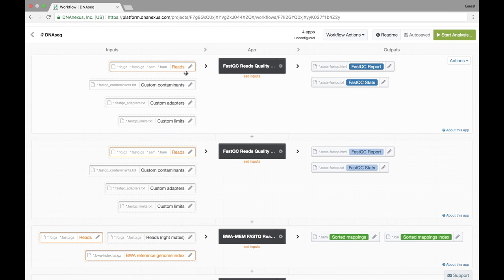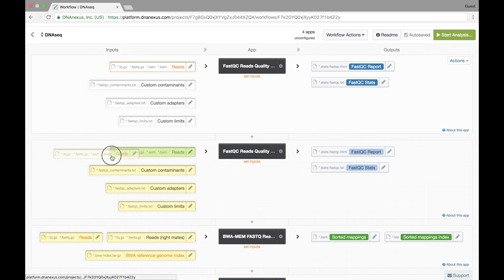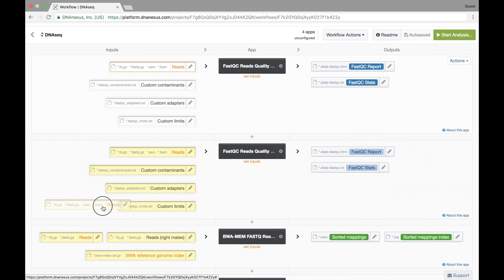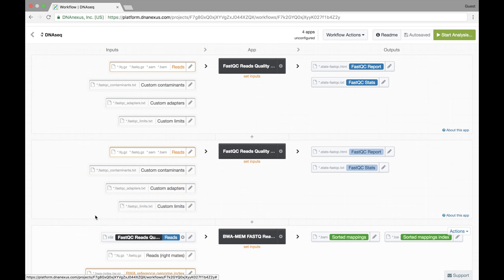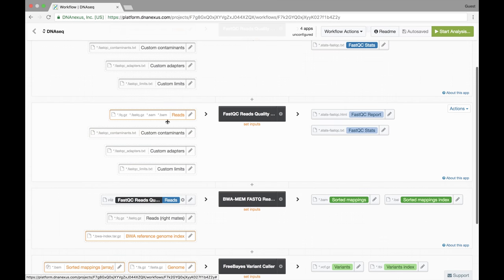We can achieve that by simply clicking, dragging, and dropping onto BWMM. And we do that again for the reverse reads.